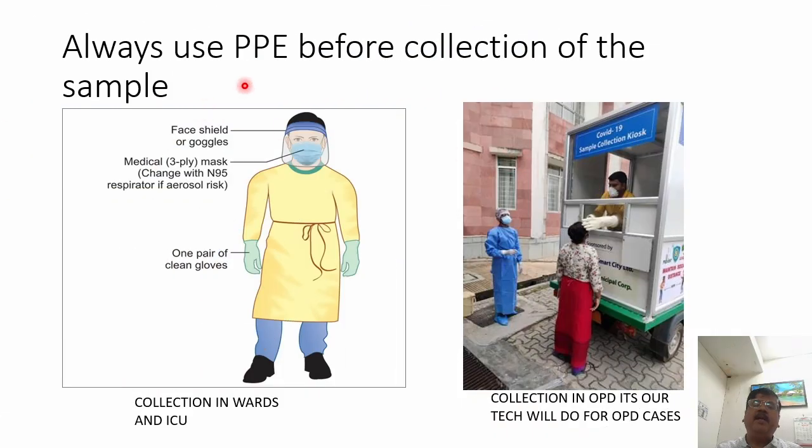Now, it is very important that as a doctor or clinician you always use PPE before collection of the sample. Whenever any respiratory viral infection occurs in future also, personal protective equipment should always be used. Donning and doffing, as all of you know, should follow a particular sequence. We go from down to up for donning, and up to down for doffing. So all those precautions. The mask should be removed in the end.